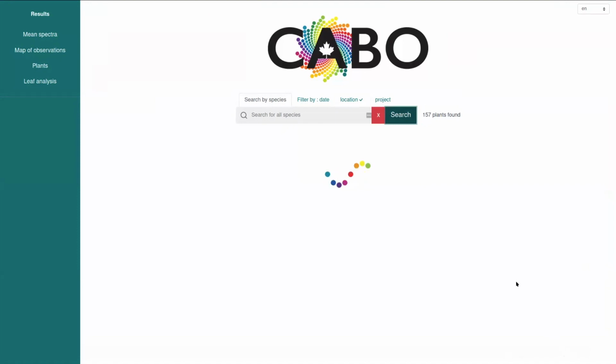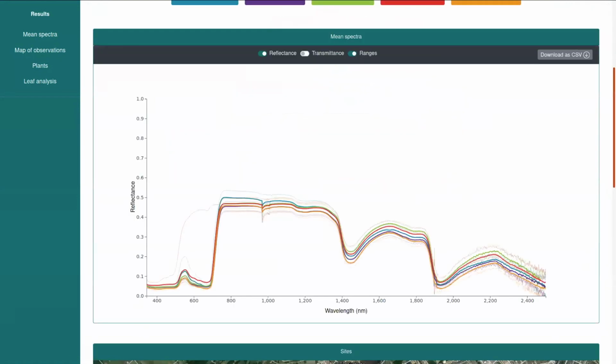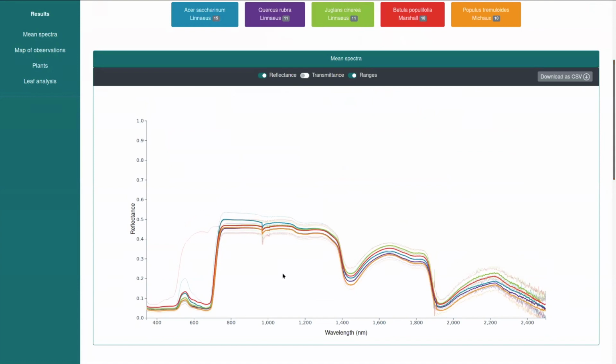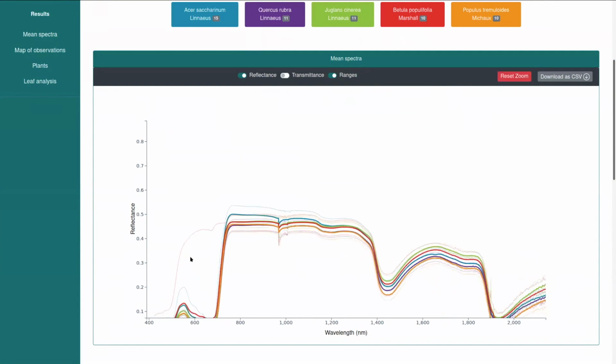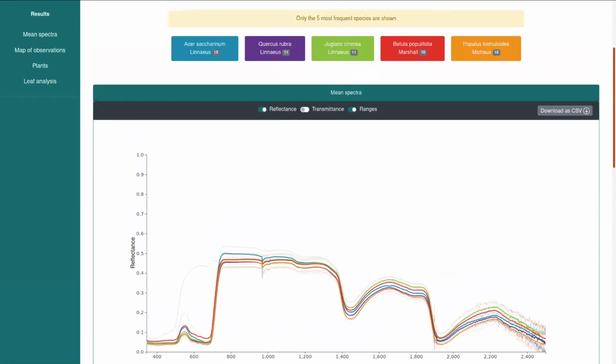So 157 plants, and it's going to give us the top 5 species found in this area. So we have this showing up here. We see there's one with a particularly odd upper boundary here. I don't know if you see this, but anyway, this is using all the raw data from CABO. So we found some of the data that still needed to be cleaned a little bit.